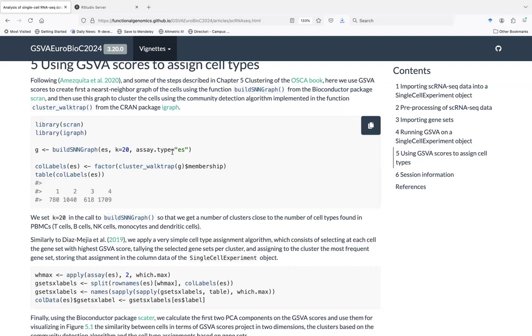So, yeah. And then another thing that is not shown here, but is on the way, is the support for SpatialExperiment objects, so that you can run the algorithm directly on a SpatialExperiment object, and it's the same thing. Parameter object, run GSVA, and just take the considerations specific for the data that you're analyzing, and that's it. Okay, I'm sorry that we couldn't do this in a more expanded way.